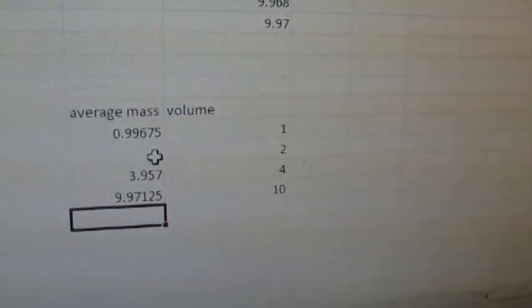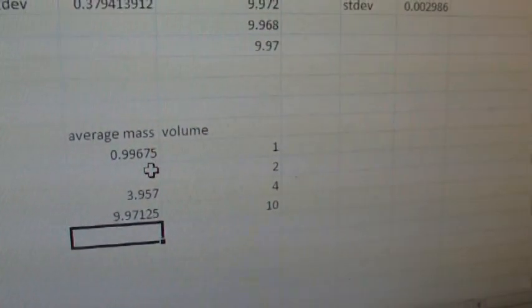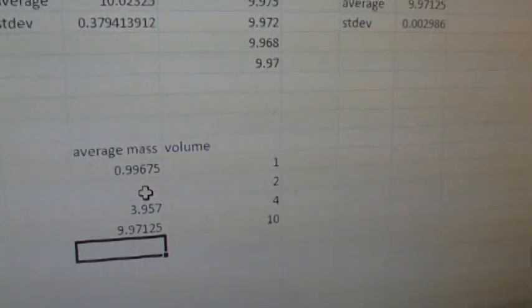And just to make life easier for us right now, you will have to make measurements in class. We're going to do it too, right? We'll do that too. Okay, so he's going to measure out 2 milliliters. How many times? 4 times, with the micropipette. And then we'll have that too. So let's do that right now. I'll leave you alone and we'll come back. We'll do that in a bit, okay? Sounds good.